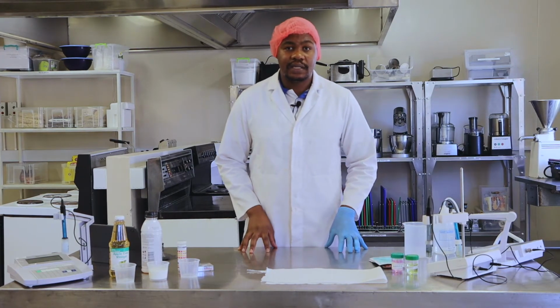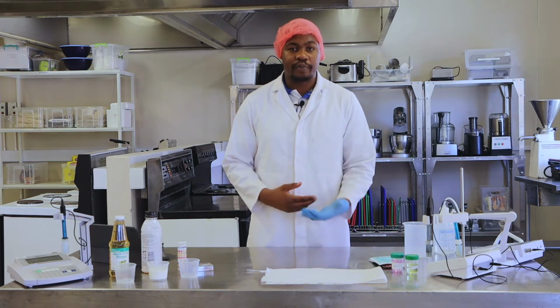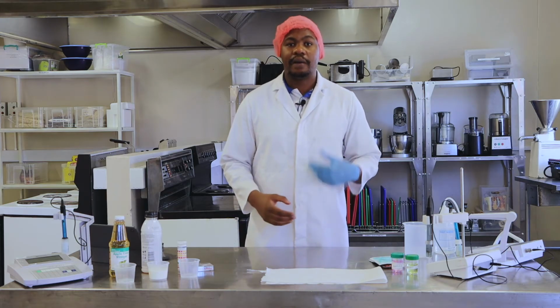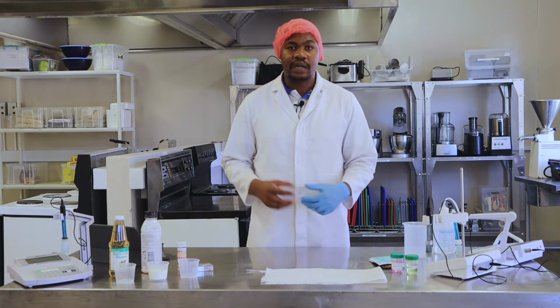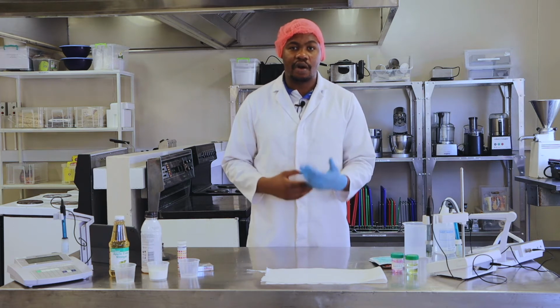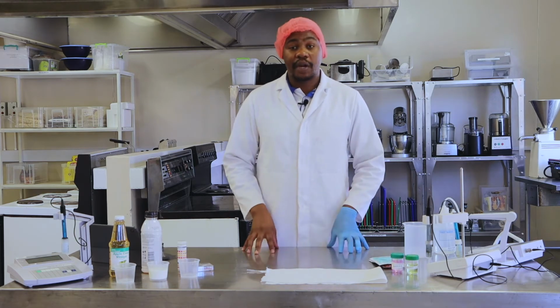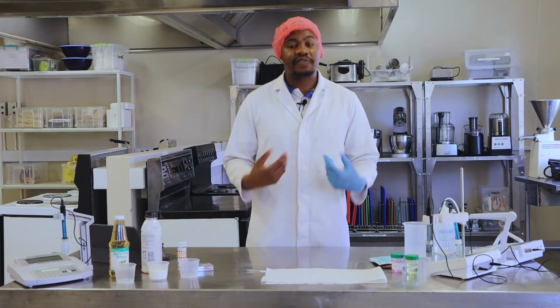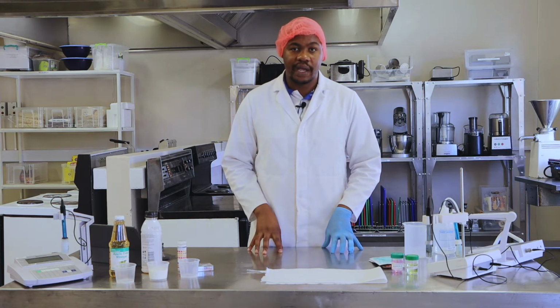In some cases, pH is an indicator of chemical reactions that are happening in food products. Take, for example, fermentation. During fermentation, microorganisms release certain organic acids as their byproduct, and those organic acids change the composition of the food product to a low acid nature. In some cases, microorganisms can also increase the pH of your food product. So it is very important to measure pH as an indicator of chemical reactions.